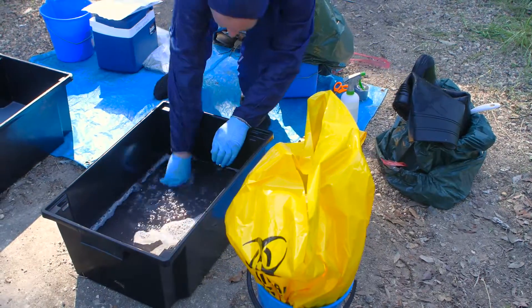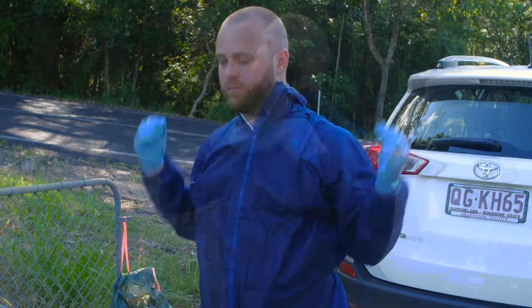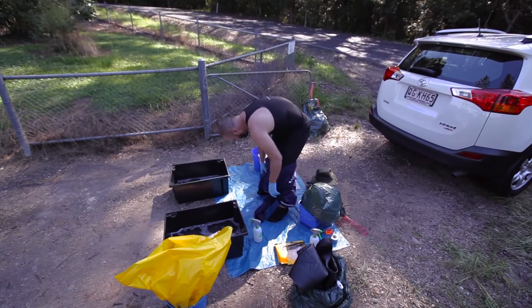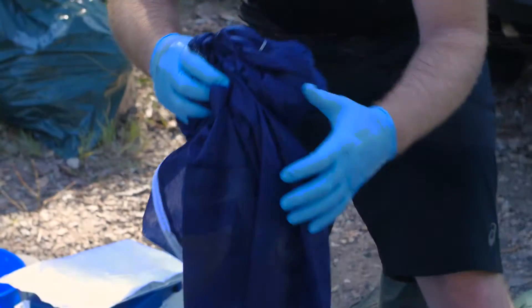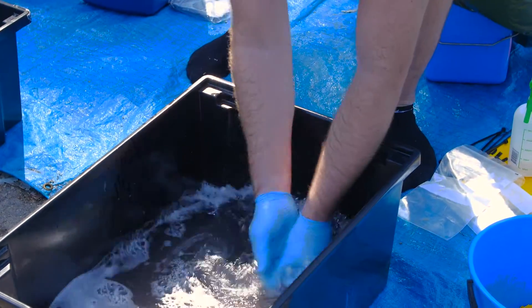Rinse your hands in the disinfectant tub as a precautionary measure. Now remove your inner overalls in the same manner as your outer pair. Roll them up and place in a biohazard bag on the dirty side. Once again, rinse your hands in the disinfectant tub as a precautionary measure.